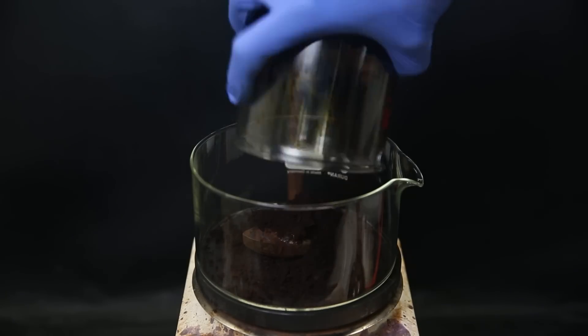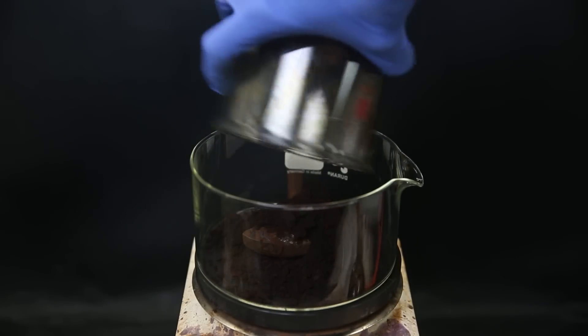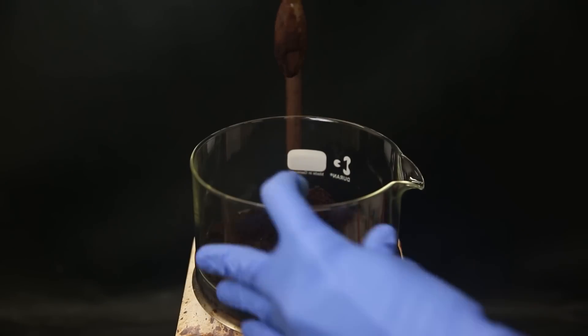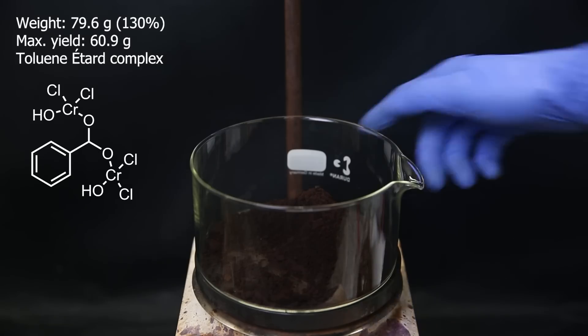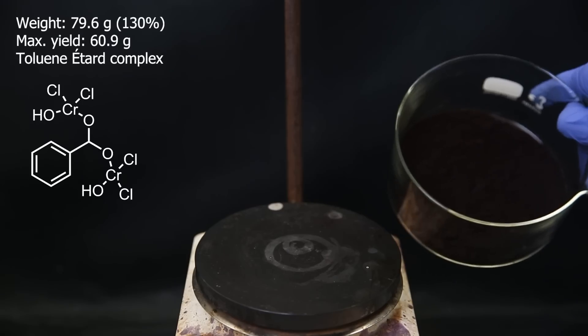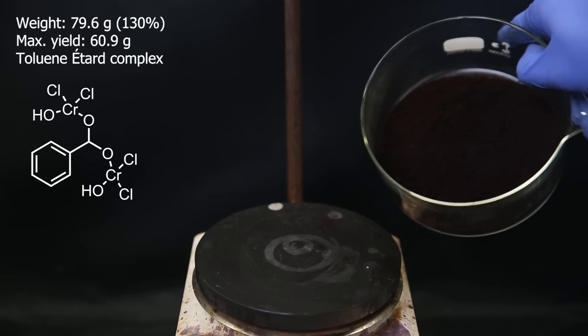The product just looks like dirt, and it also fumes a bit. There's probably still some unreacted chromyl chloride soaked into the solid, as well as carbon tet, which also explains why the weight is more than the maximum possible yield. Nile didn't show its yield for this step, but it doesn't really matter if it's still wet.